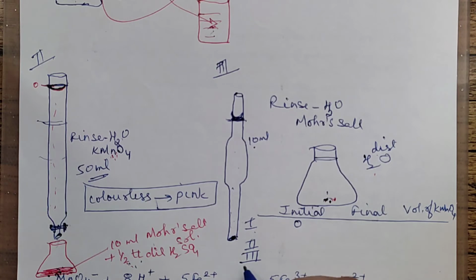Say initial was 0 and this final came out to be say 11. Right? And now your initial is 11, and now you are getting this as say 10. For example, this is 21. I was writing the difference, 21. Right? And now suppose your initial is 21 and your final becomes say 31. So this difference was 11, this was 10, this was 10. A rough example I am giving.